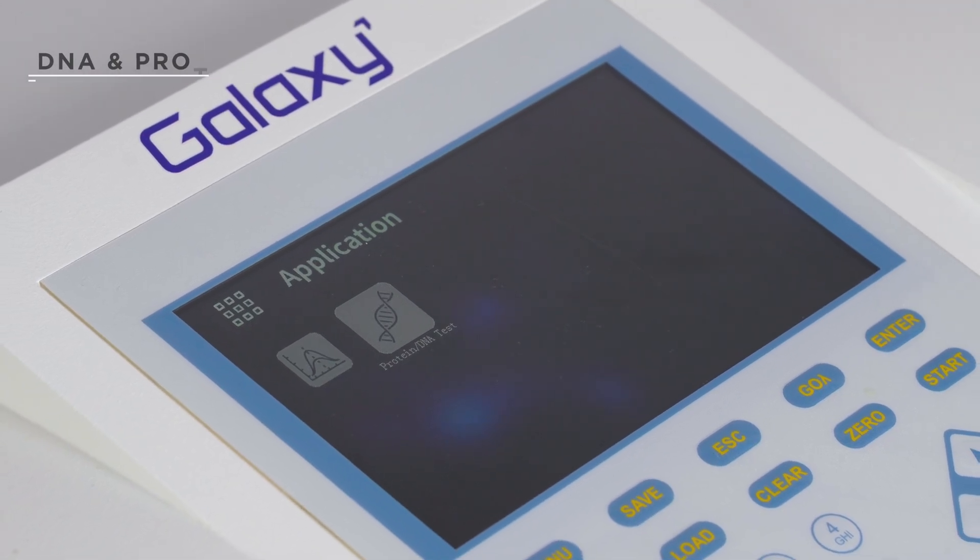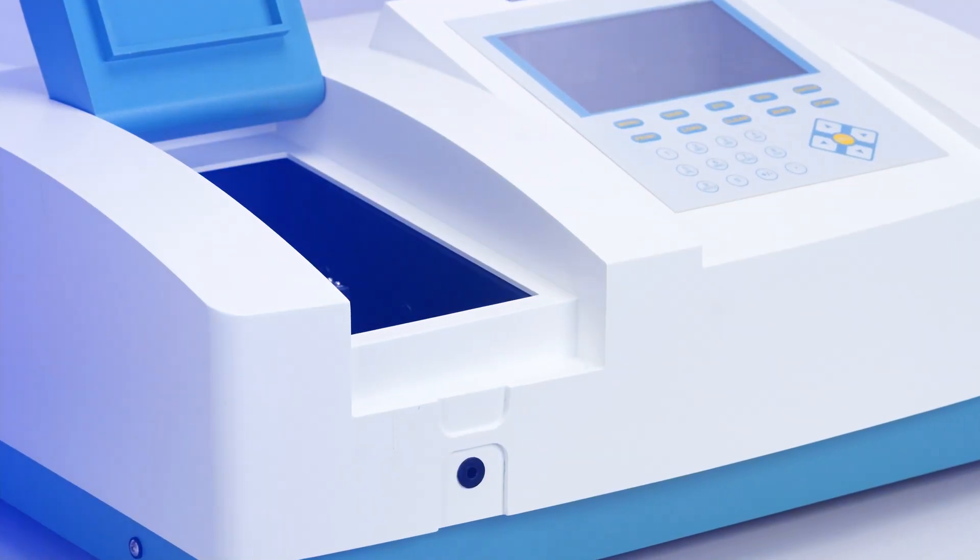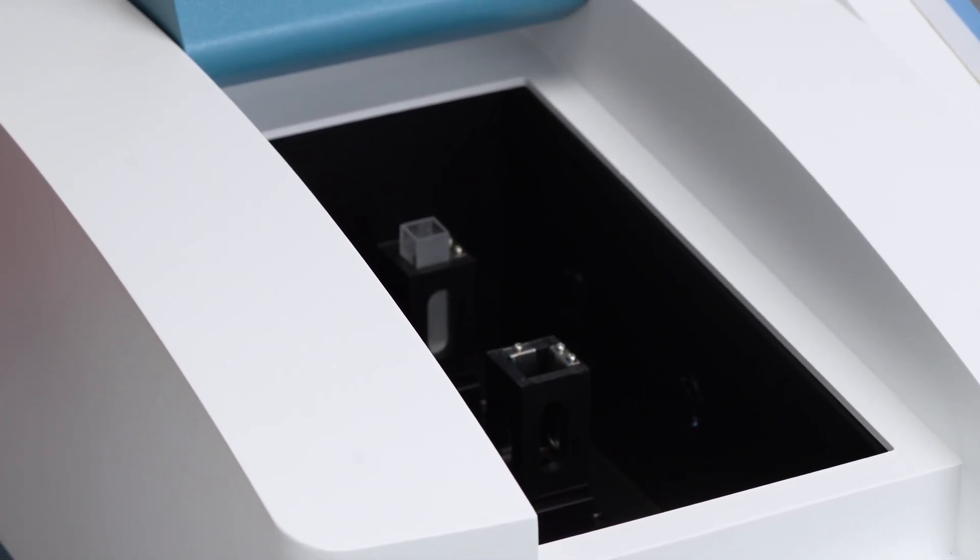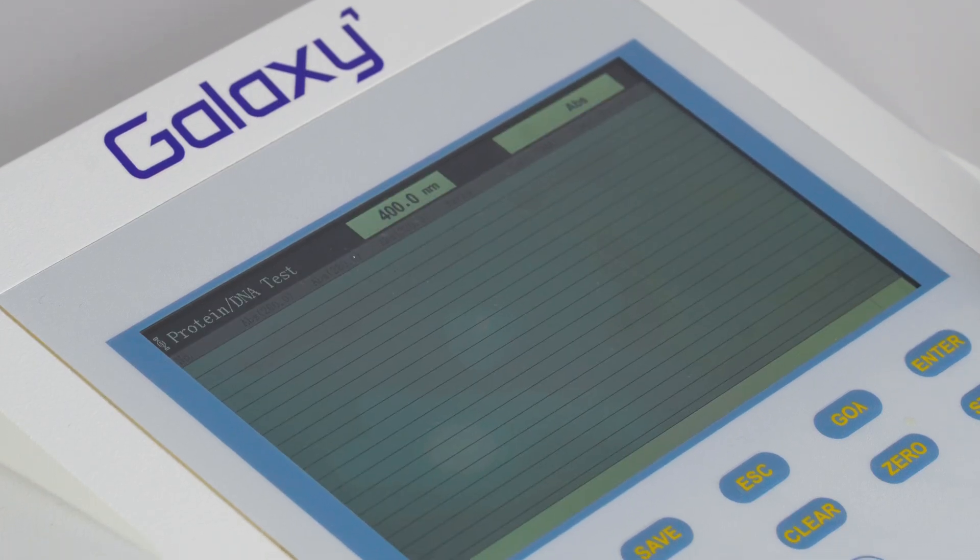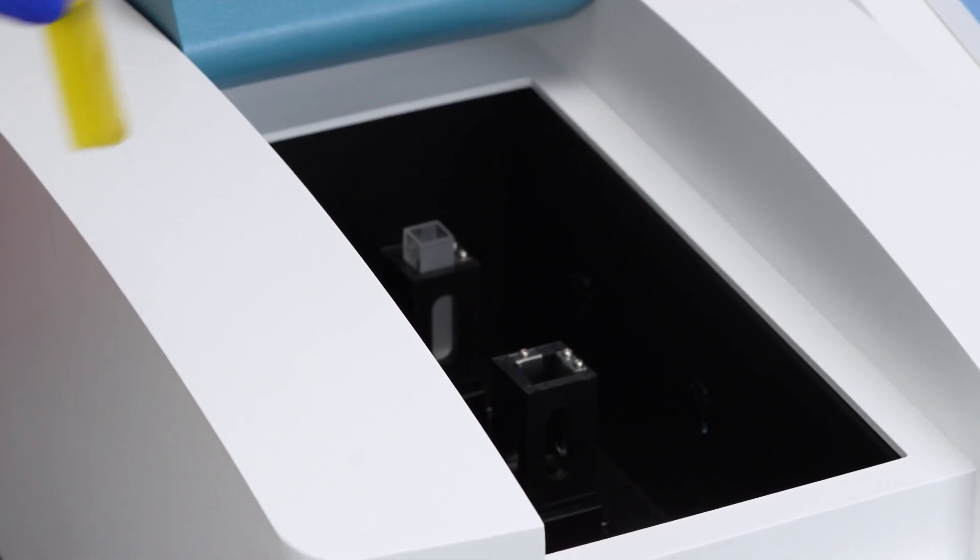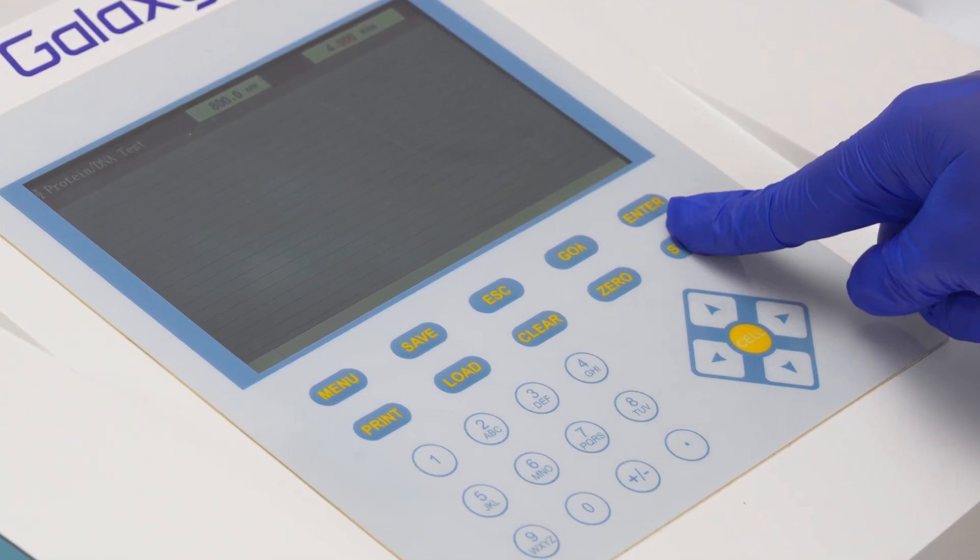In DNA and protein analysis, place nucleus-free water for blanking. Click set blank to zero the baseline. Insert the sample and press start to read absorbance.